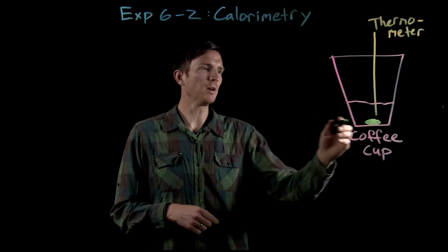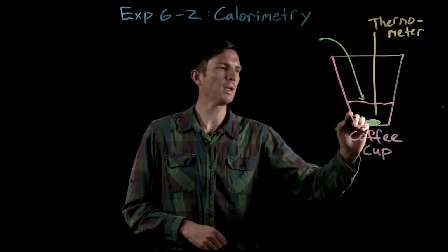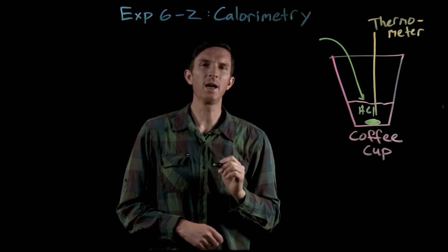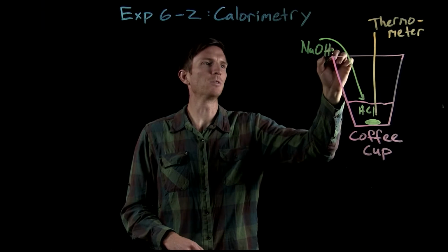Okay. So we'll start with our solution in here, and maybe we have our hydrochloric acid in here, and into that we can add our sodium hydroxide.